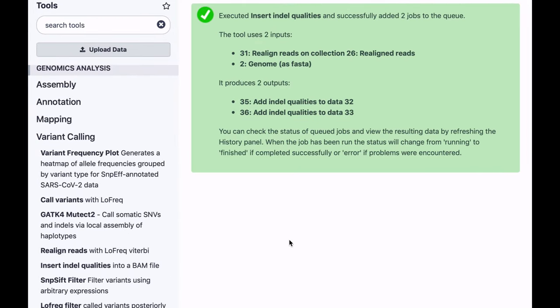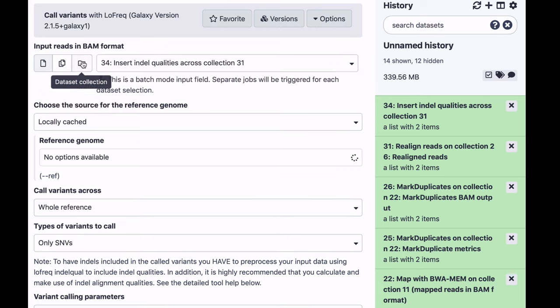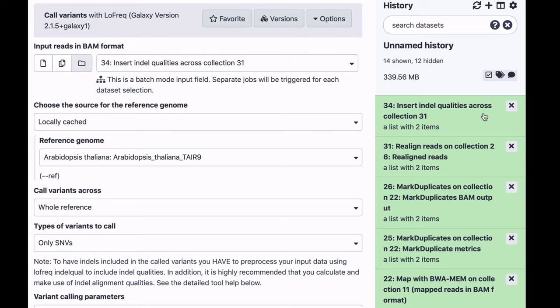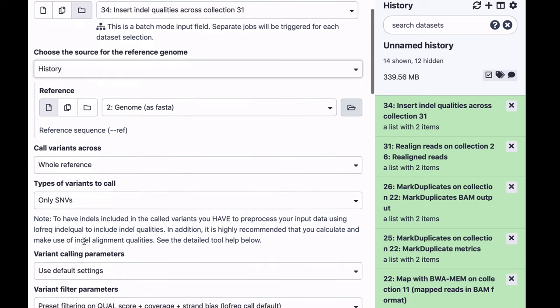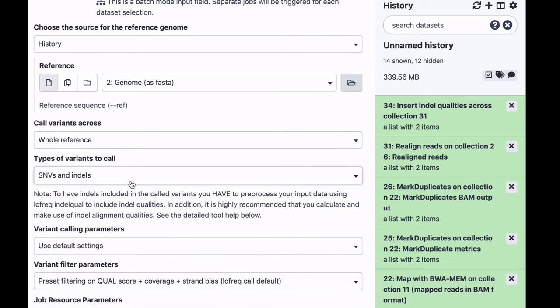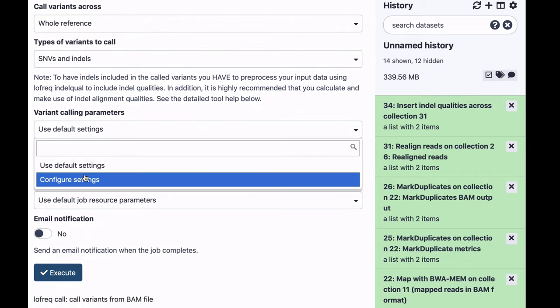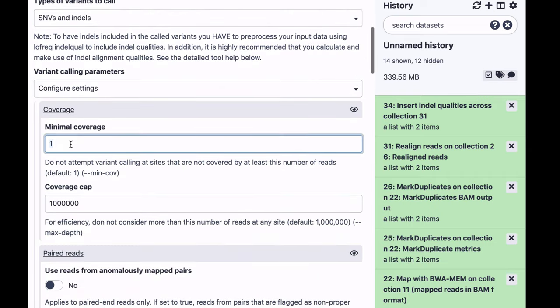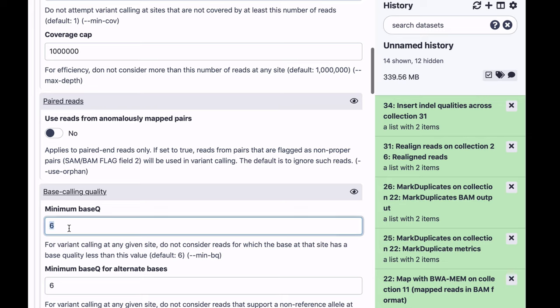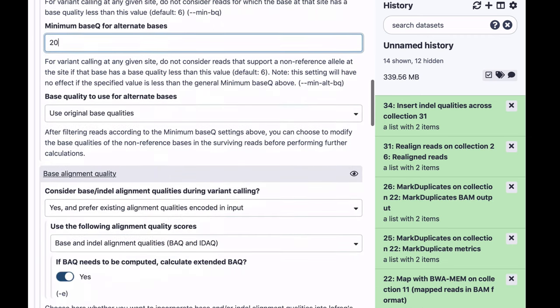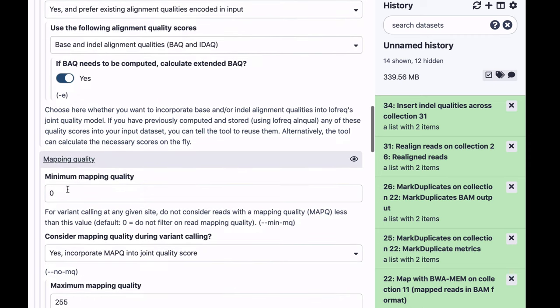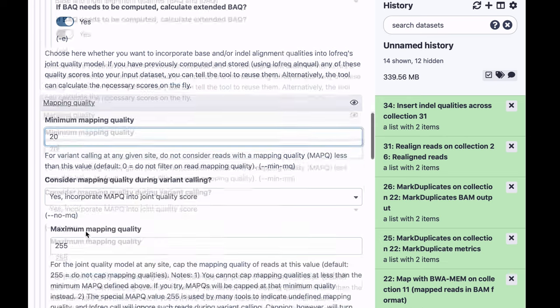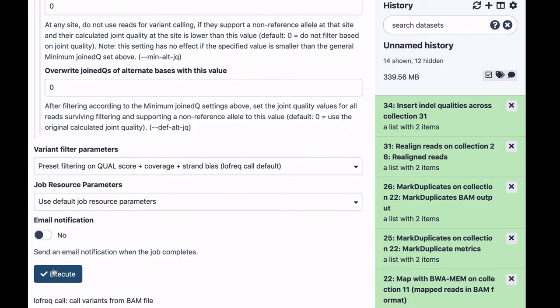And now we can actually call variants with LOFREQ proper. So input, again, as a collection produced by indel quality recalculation tool. We're going to select the reference genome. Now this tool requires a little bit more configuration, so we want to call both single nucleotide variants and indels, and we're going to tweak some of the variant calling parameters. For example, let's set minimum coverage to 50, set minimum base quality to 20, and mapping quality to 20. That means that multi-mapped reads will not be used for calling variants. Everything else we can leave the same.